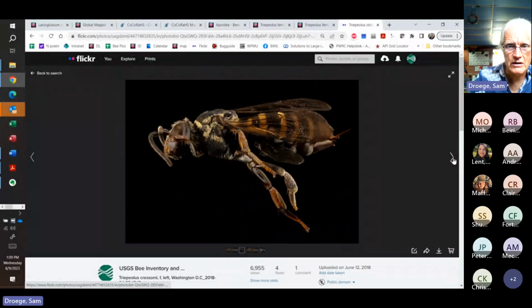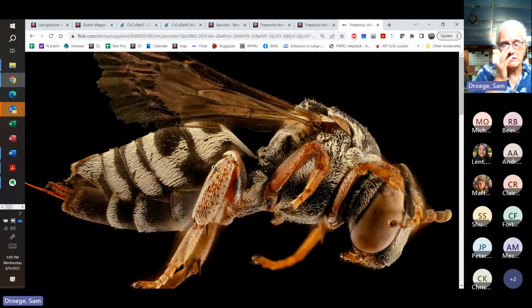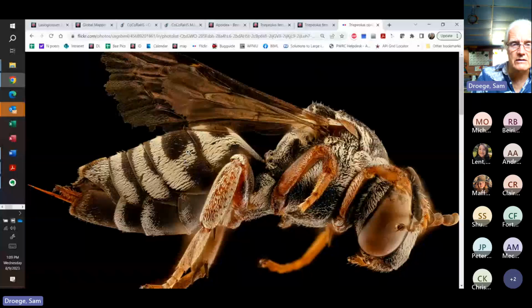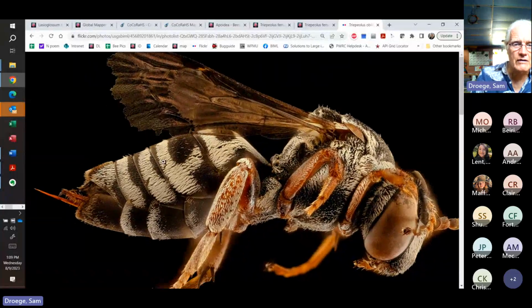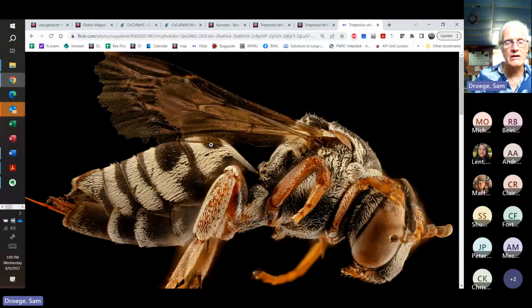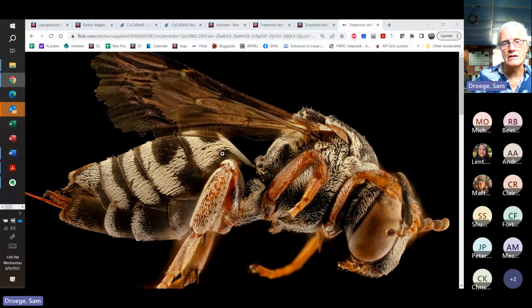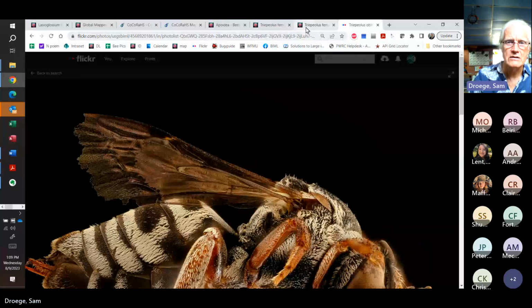And then the patterns of those hairs are often extremely useful in determining species. So here, for example, we're looking at T2. We'll come back to this. Here, this arm coming up, the angle of that arm is different in different species groups. The length and width of that bare spot on T1 compared to the sides is often quite different. So let's jump back to the guide.